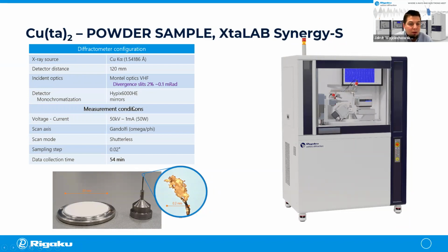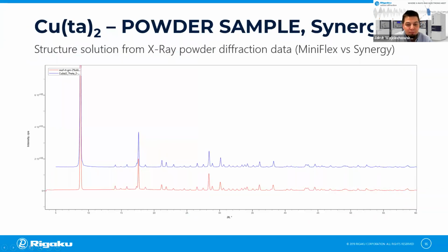And we have also Hypix 6000. So Maciej gave me a challenge that it should take less than an hour, because he thinks that this is what he usually measures. But of course, the beauty of this method is that I don't need a huge size of the sample, but a really tiny amount. And how does the data look?